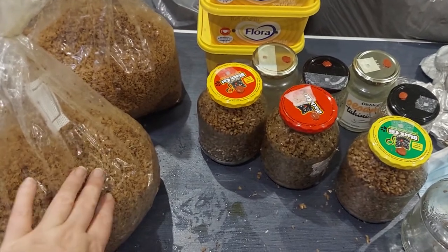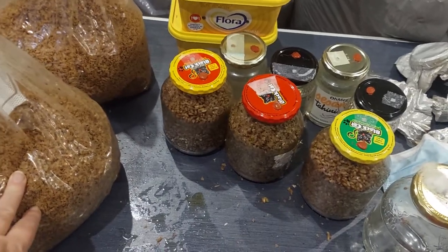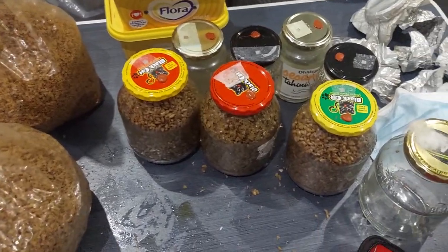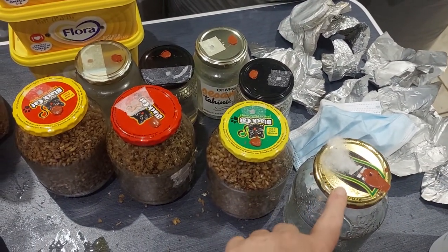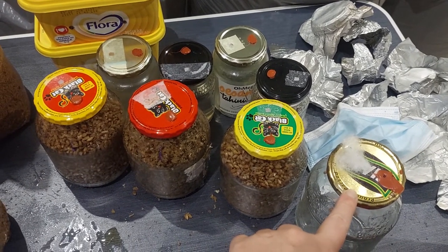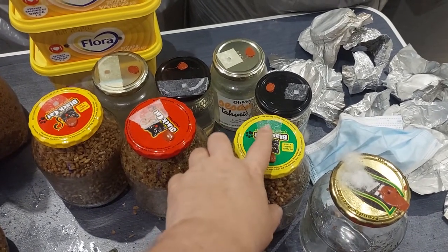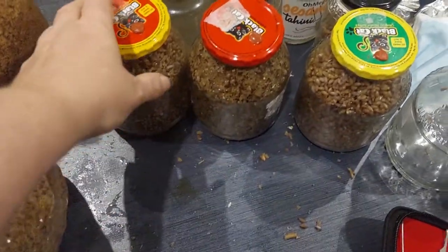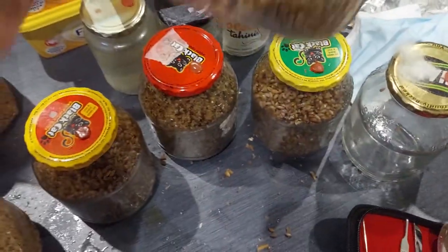A few notes: I'll probably add some dry vermiculite next time to absorb any excess water during sterilization. The pillow stuffing on the jars did get into the grain spawn, so I'll probably stop using that altogether and just continue with the micropore tape, depending on how well that goes.